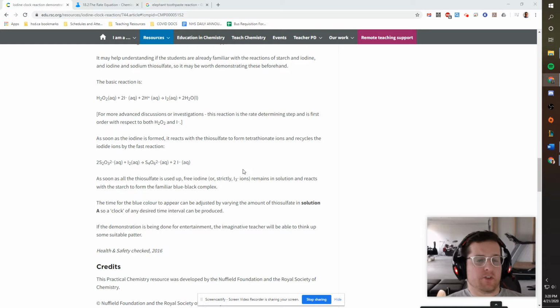Hey guys, it's me. I'm just here posting a little bit of an introduction to a little chemistry demo Mr. Sreda and I did to show you guys some reaction rate stuff. I'm going to post two of these little introduction videos for two different lessons. The first one we're going to look at is called the iodine clock.